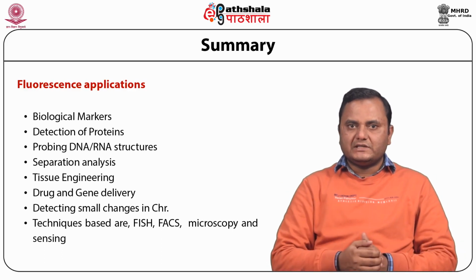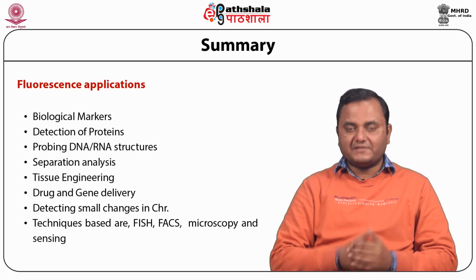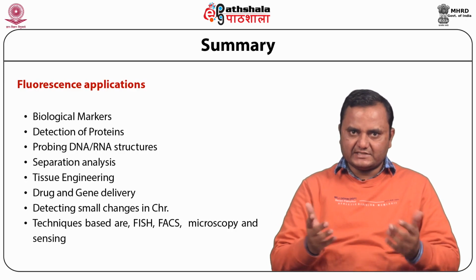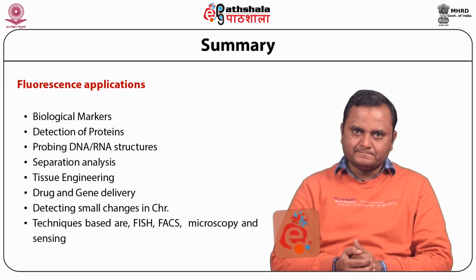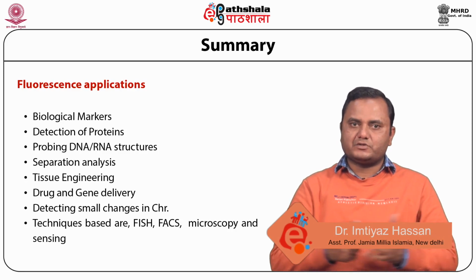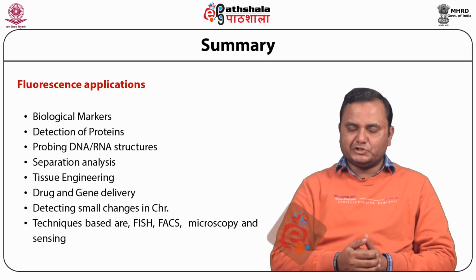And there are other techniques which are based on the fluorescence method: fluorescent FISH, that is fluorescent in situ hybridization, FACS, fluorescence activated cell sorter, and microscopy, especially fluorescence microscopy, and the sensing application.